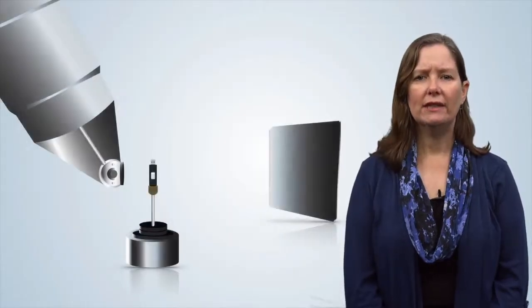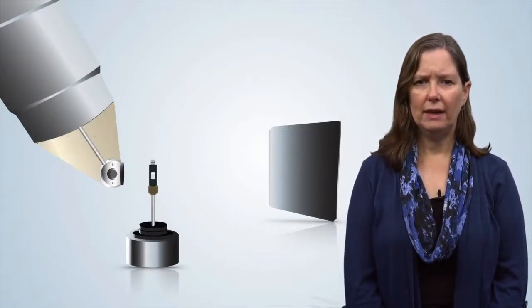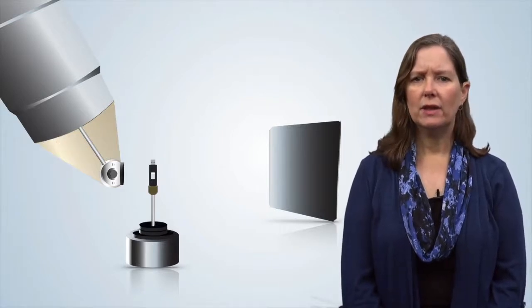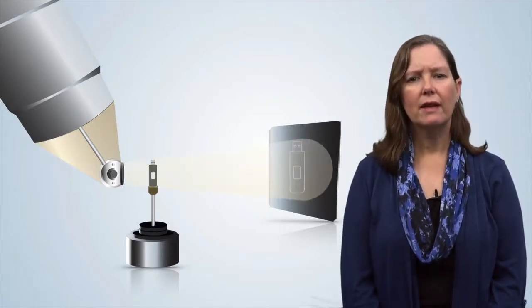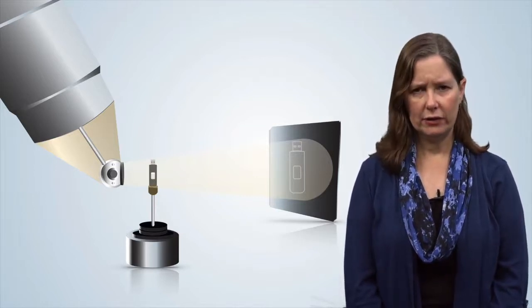The MicroCT generates x-rays by shooting electrons through a vacuum and hitting a tungsten target. These electrons interact with the tungsten to produce a cone of x-rays that shoot out toward the sample sitting on a central stage.